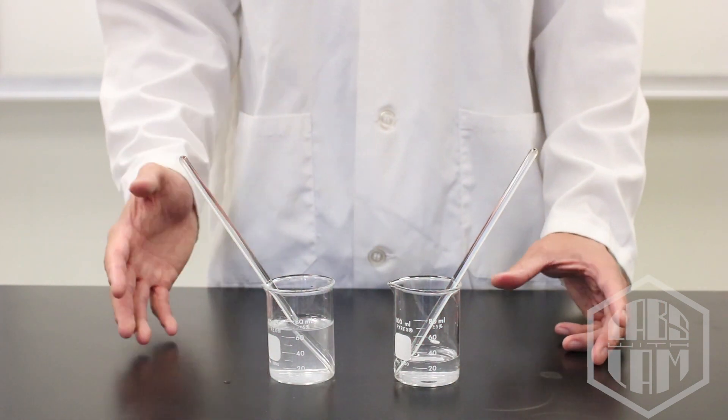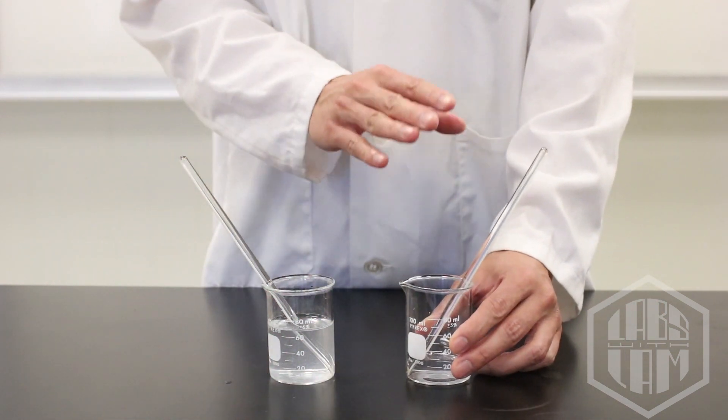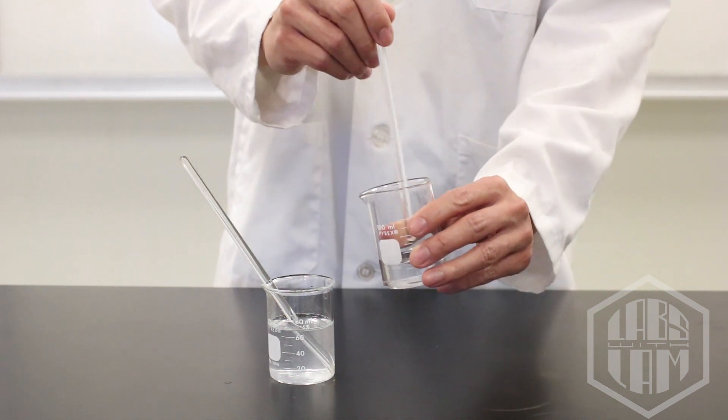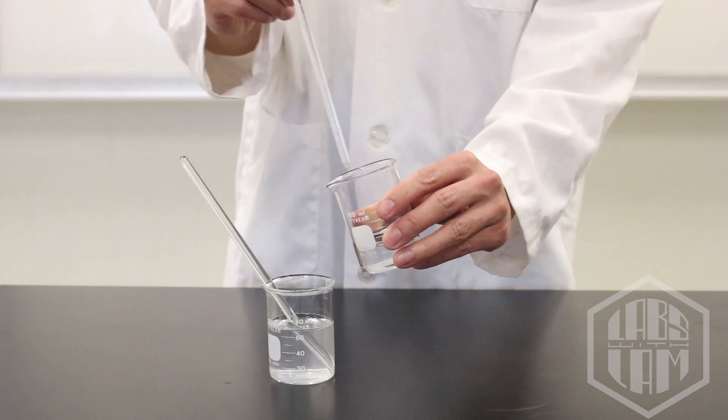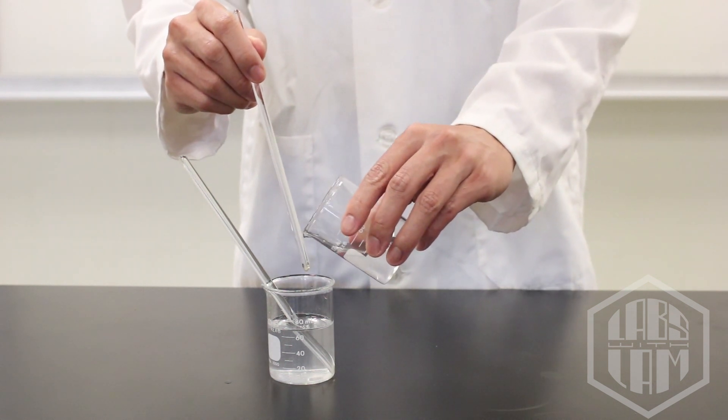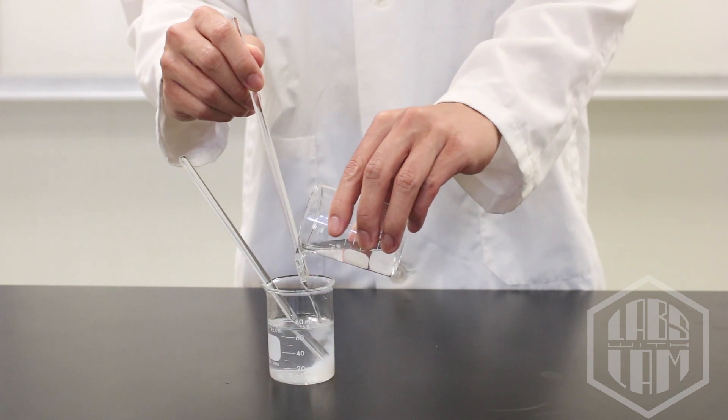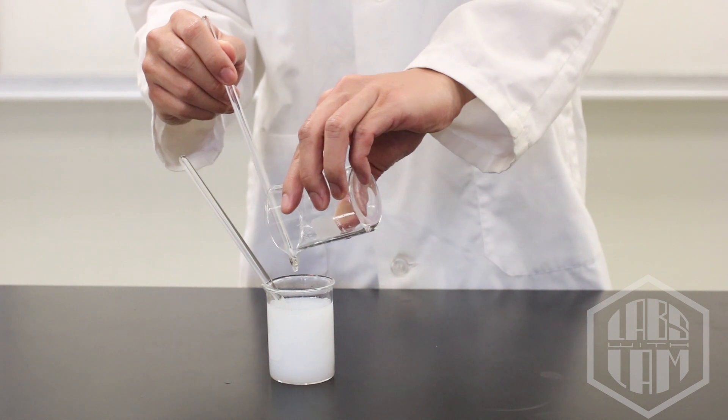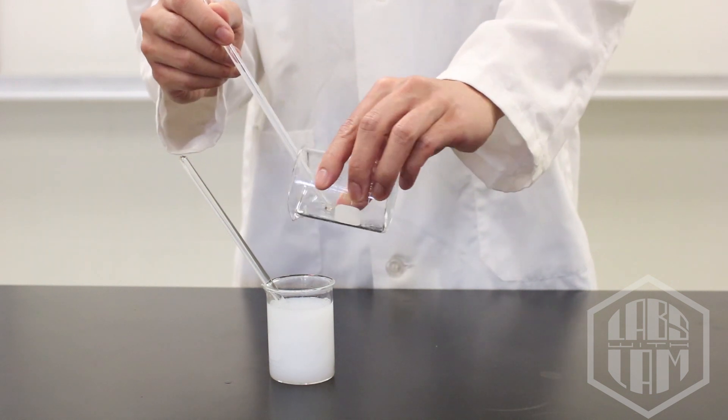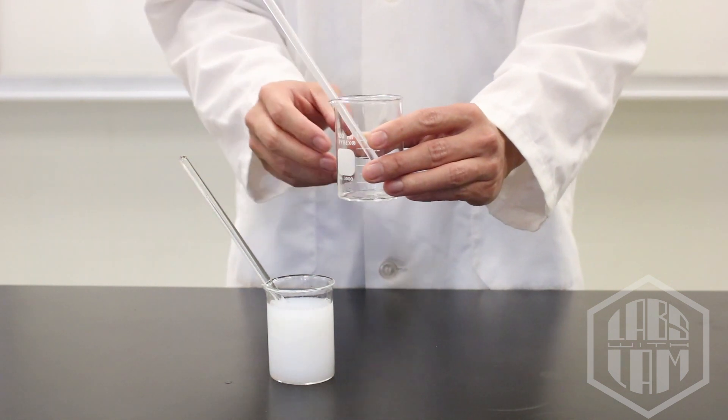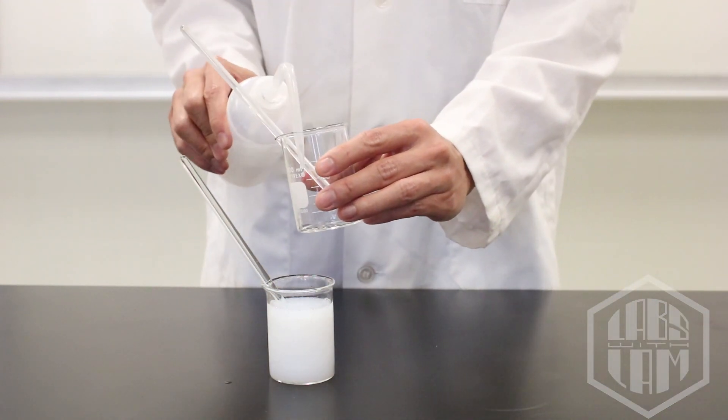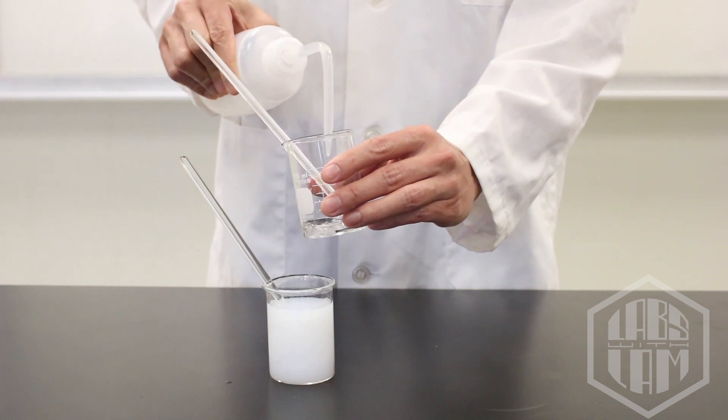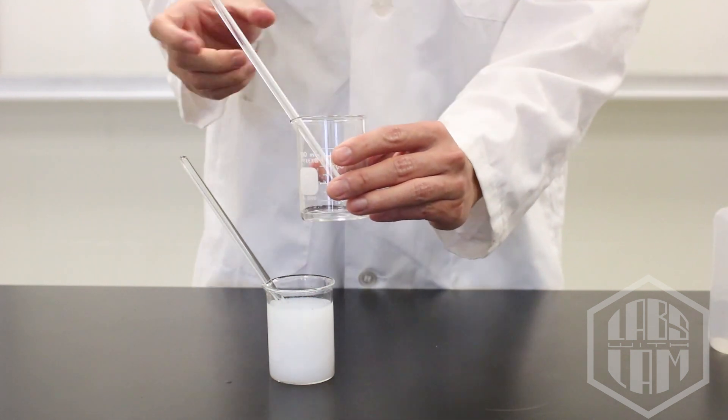Once both solutes are completely dissolved, I'm going to pour my calcium chloride solution into my sodium carbonate solution. Notice the way that I'm pouring it. I'm going to pour it against the stirring rod to minimize any spillage. I'm also going to add a bit more water to my calcium chloride beaker just to rinse it out along with the stirring rod and try to get all the calcium chloride into my reaction.